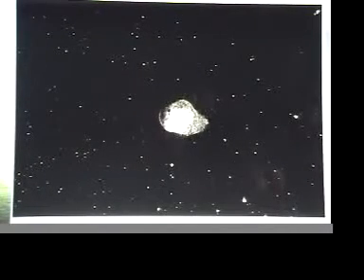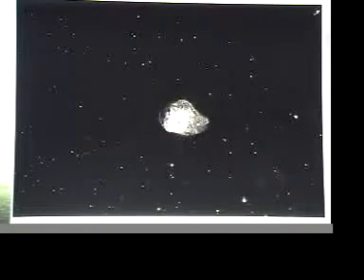Continues to change. You can adjust the contrast of the situation. It's fascinating. You can see morphological changes here. It's like an internal fireworks. There's just a sparkling going on throughout the inside of the organism. I'm afraid your camera is not picking this up as well as I'm seeing it. And we're seeing a tiny organism float by above.